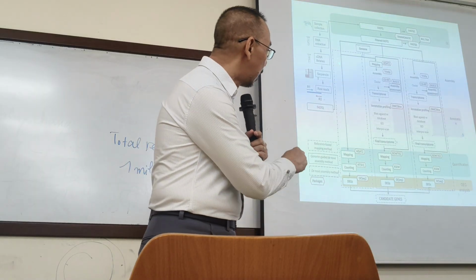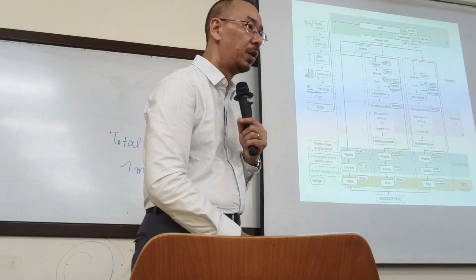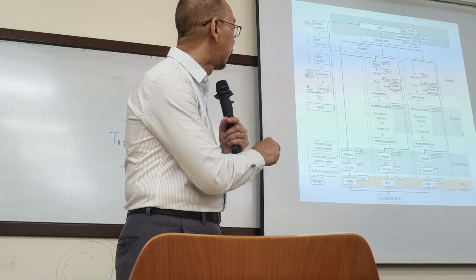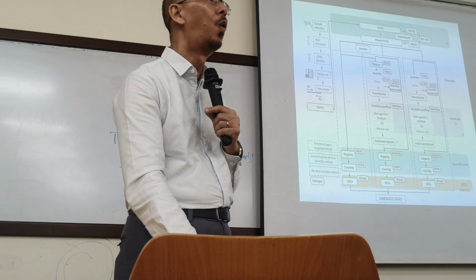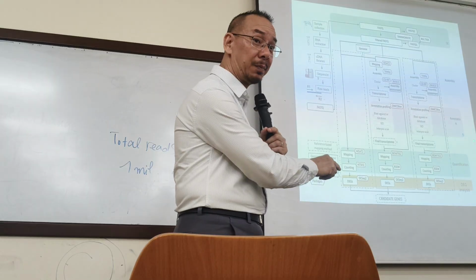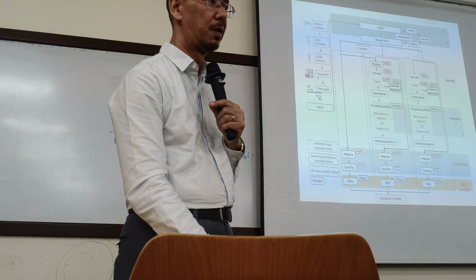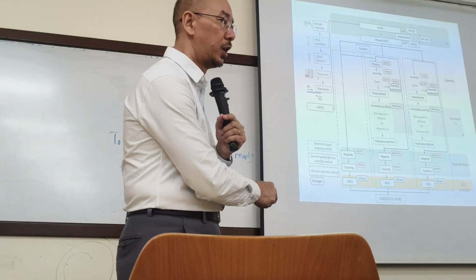We also have the other approach for quantification, mapping and also counting. This one maps directly to the reference if the reference is available. This one is based on the new assembly. Here, map to the genome available. So for quantification, we have three approaches.